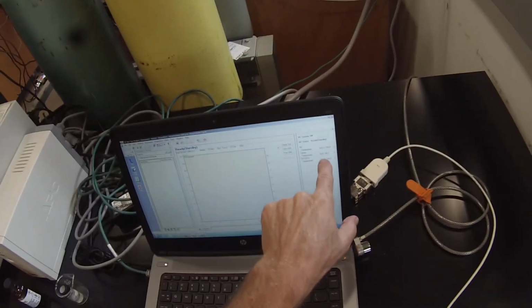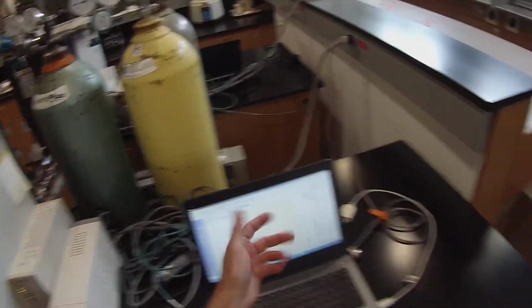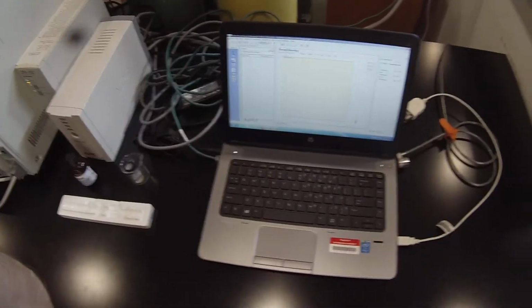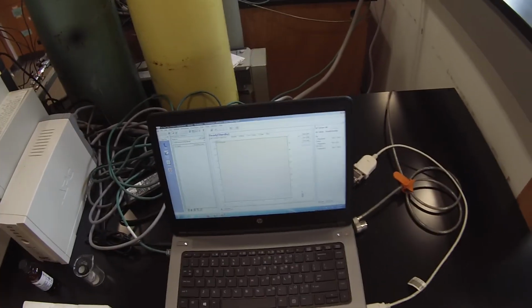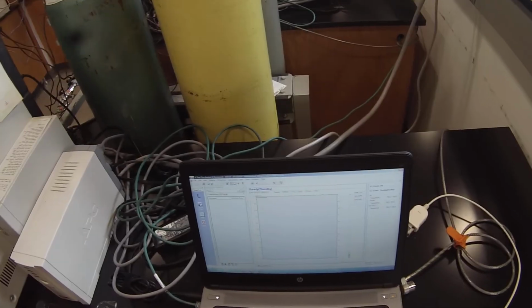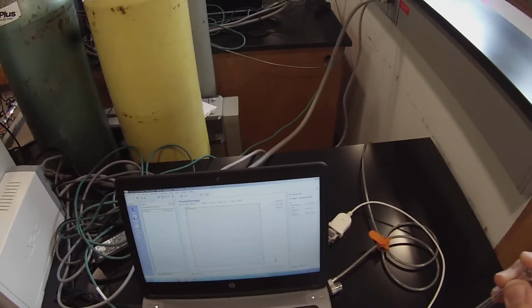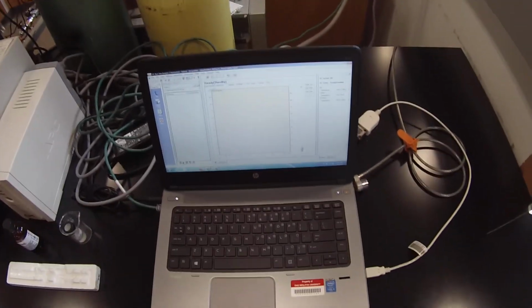So now it's hit 59.5. It overshot a little. It says it's ready, but I'm going to wait for it to actually equilibrate to 60. This will change the retention times a little bit, so I'll have to adjust them in the solvent table.